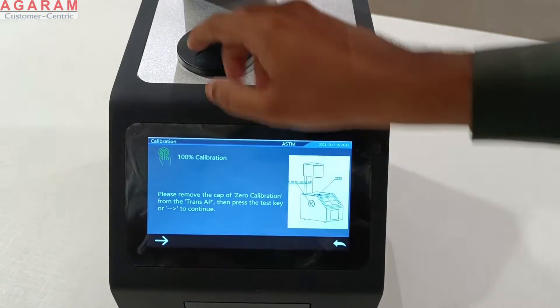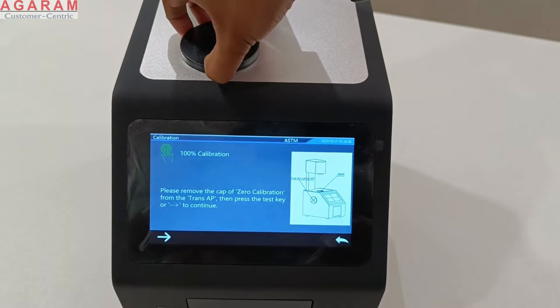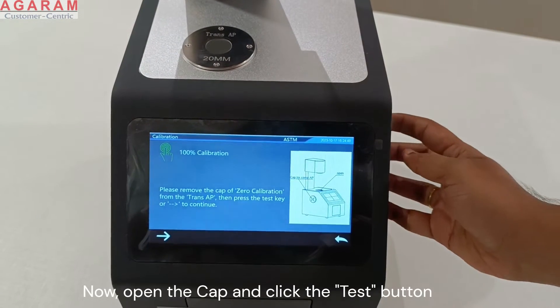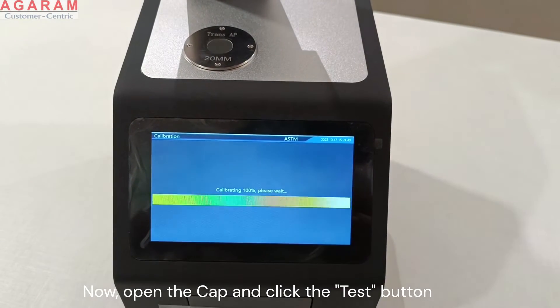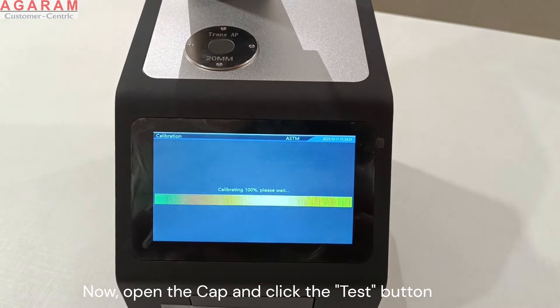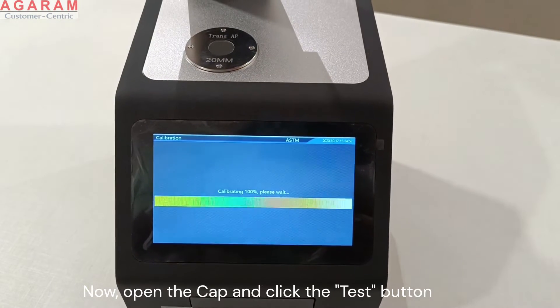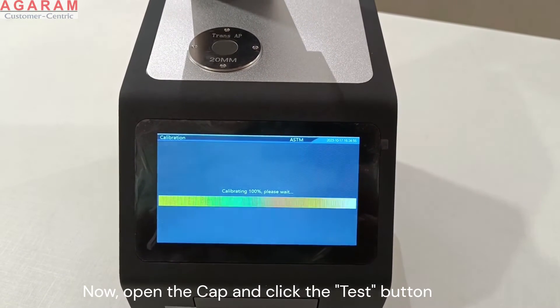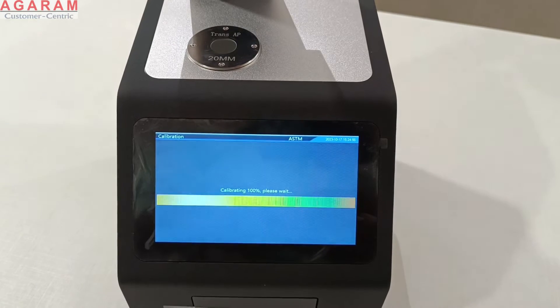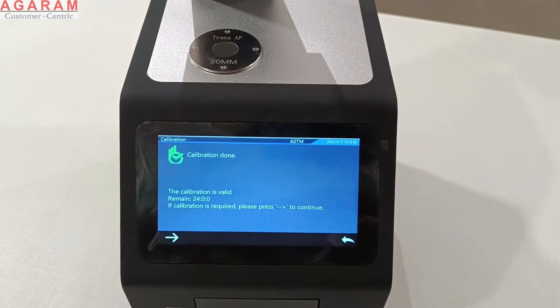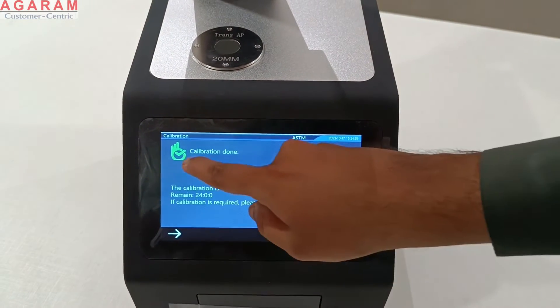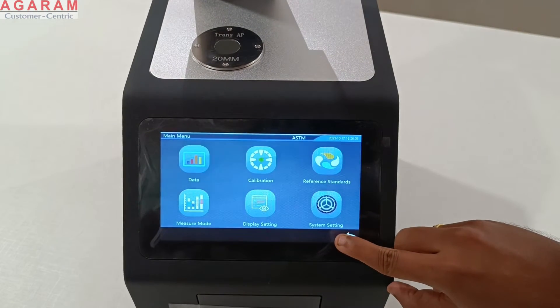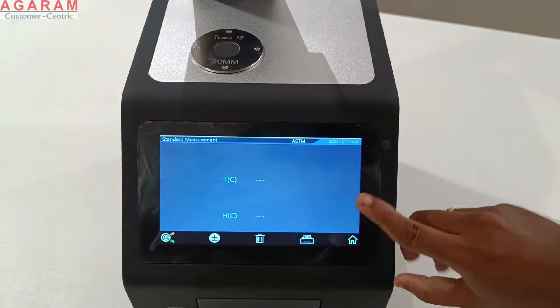After this, open the aperture cap and press the measure button once again. Now 100% of the light would pass through the aperture — we call it 100% calibration. This calibration is valid for 24 hours, beyond which you would be prompted to calibrate once again.